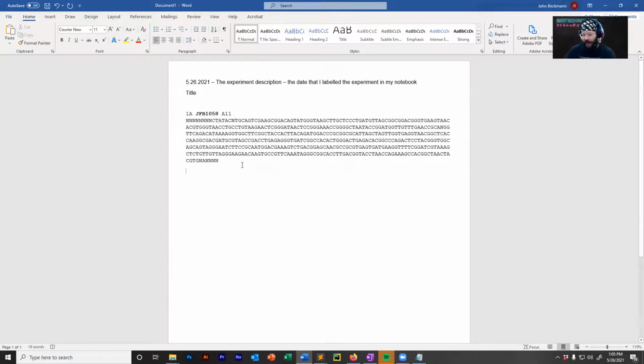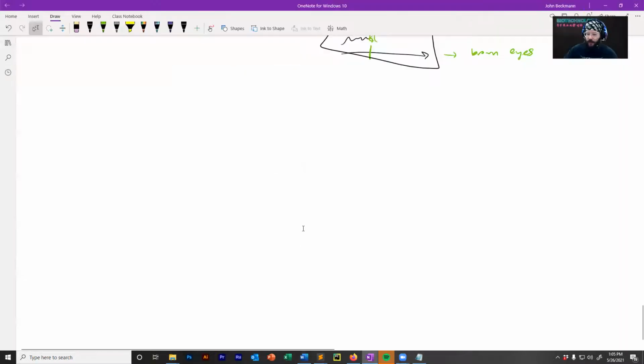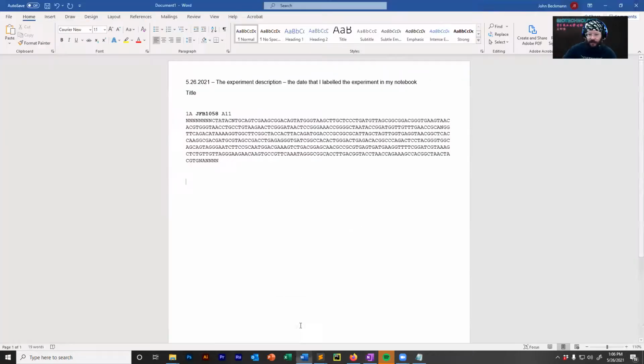Okay, so now we want to analyze what it is. The context of this experiment, I'll just quickly describe. We had an unknown bacteria. We want to know what it is. And so what we did is we did 16S ribosomal DNA sequencing of an amplicon. And now this is the Sanger data that reflects that. So this is a classical experiment: you have some unknown organism, you want to figure out what it is, you just do some 16S PCR amplification and Sanger sequence it.